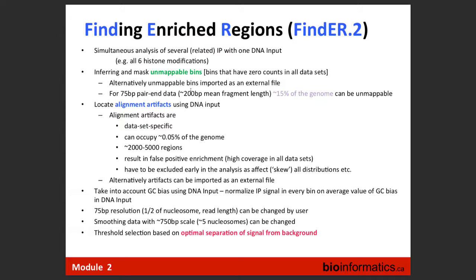Now, if we take our sequence reads and look at their distribution, it is not going to look like that. We have a bias. If we have our IP, this may be expected. Martin already alluded to this a little bit. If we have an H3K4me3 mark, this mark happens predominantly in the promoters of genes. We know that those locations are GC-rich, so our reads will be skewed. We will have a peak looking like this, skewed to the right. But if we have an input, we don't expect this. We want to see something which resembles our genome, resembles this curve.